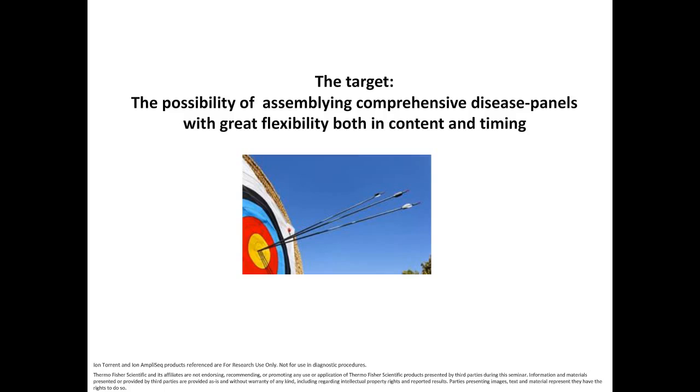The characteristics of the new systems are finally those that will allow flexibility in choosing targeted panels, which is what we were expecting, because to work with panels very often is to work with something that we keep chasing, with a situation that keeps moving. So we need to be flexible, and we need to be able to adapt this flexibility to our experiment. If I want to expand my panel because I find a new gene in the repository, I can just add it.